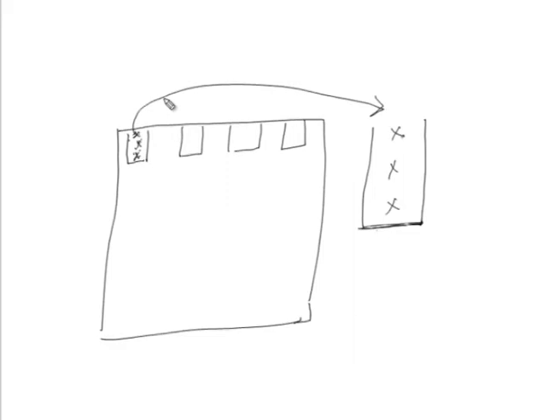Now obviously when you have dilute solutions, like this is your amount of sample you have taken and it is a large volume, then since your analyte or your molecule is distributed all over, the molecule which is closest to the gel interface will enter first and will also move somewhat on application of electric field. But this molecule with the same analyte will enter with a time gap relative to this one. That is, if I say this is number 1 and this is number 2, then 1 will move somewhere, then 2 will enter. So what will happen? Maybe they catch up slowly later on, but still they will not be able to be like this; rather, a broader band will be seen rather than this kind of band.